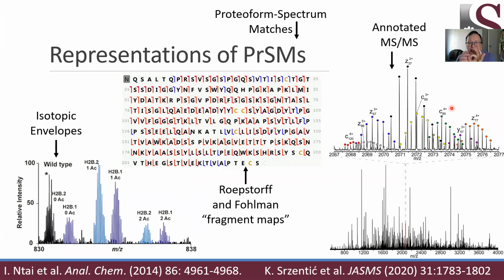So even though we're looking at a very tiny part of the tandem mass spectrum, it is absolutely littered with fragment ions appearing in different charge states, containing different numbers of amino acids, appearing in multiple isotopes. These spectra put a real premium on resolution. It should be apparent that looking at the annotations of tandem mass spectra is quite complex when we get into top-down proteomics.